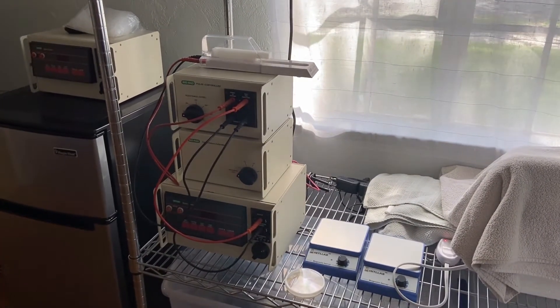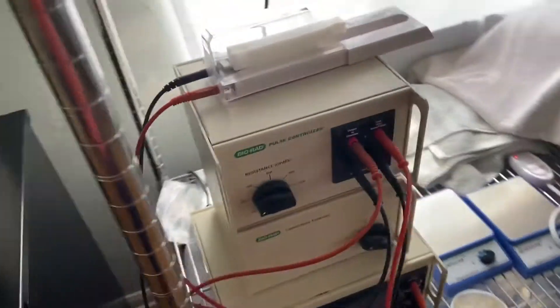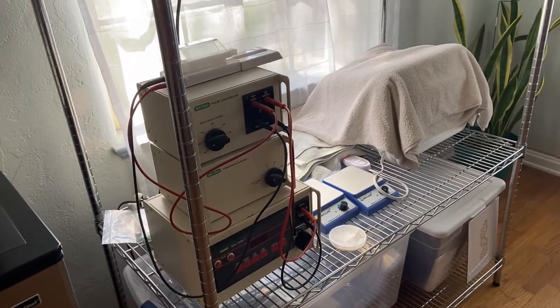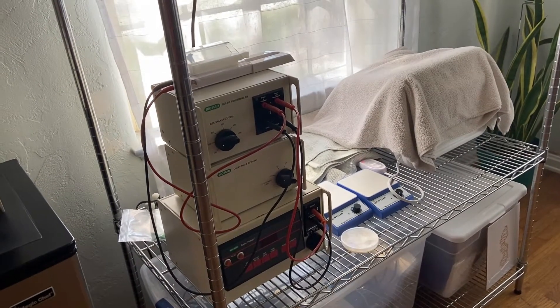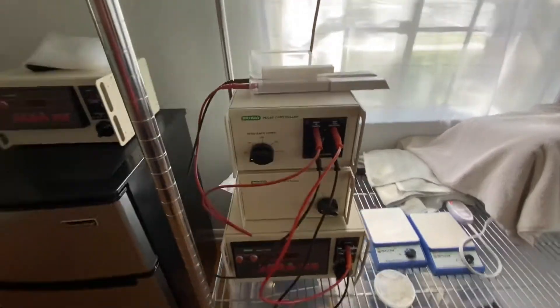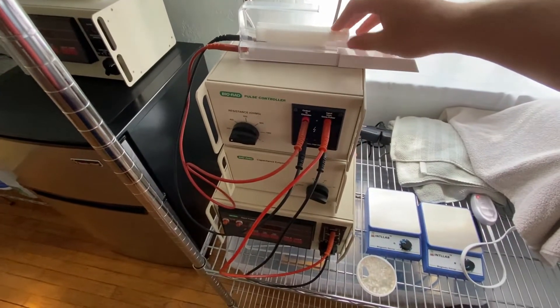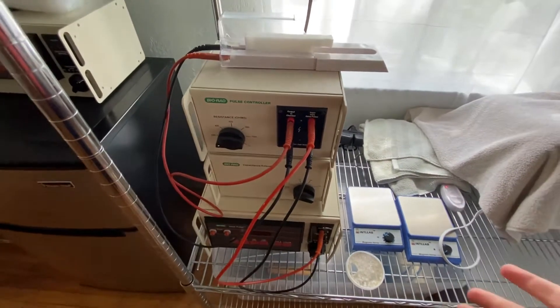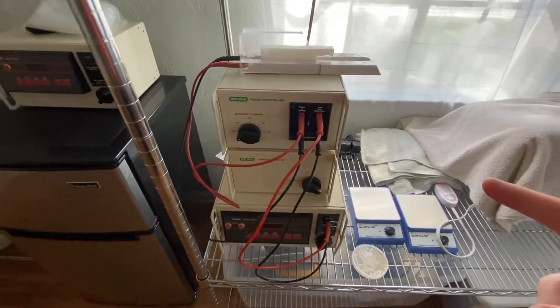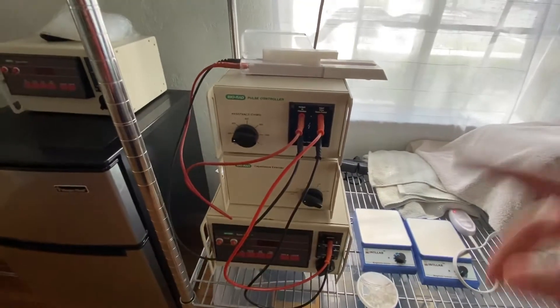I'm going to do something a little different and try to catch you up to real time. Things go according to plan — which is rare in this sort of environment — this video will make it live tonight. I keep pointing the camera at this electroporator because this is what I'm going to be practicing on, so that when I get the agrobacteria — which is kind of expensive — I can be reasonably sure it will work. We're going to practice putting the plasmid that we're going to be putting into the fungus into E. coli first.